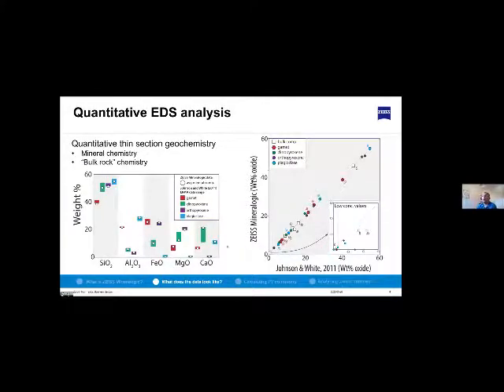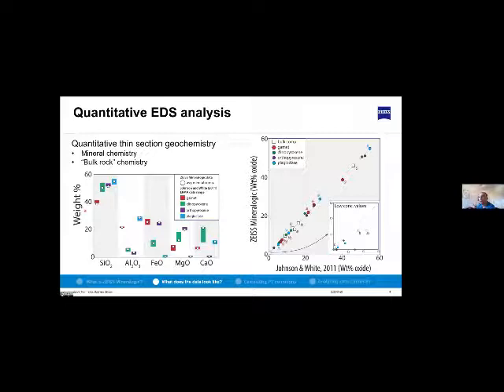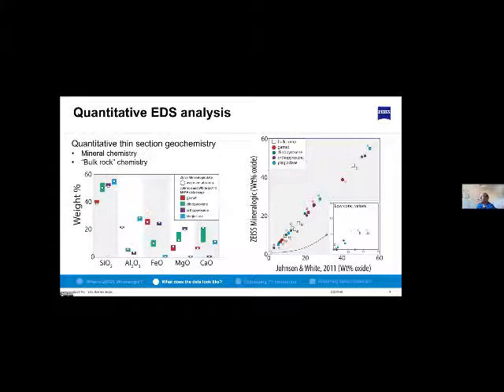This is particularly useful for students. Looking at what that data looks like, here we have a comparison from the Johnson and White study. The colored bars show the electron probe mineral chemistry — red for garnet, green for clinopyroxene, purple for orthopyroxene, light blue for plagioclase — and the white circles represent the mineral chemistry from the Mineralogic thin section scan. What we can see is that the mineral chemistry from Mineralogic comes out very similar to, or bang on, the compositions from the previous study using WDS on the electron microprobe.